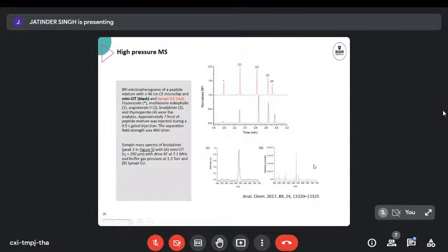And selective ion chromatography events could be collected with this field portable mass spectrometer as well. Here you can see the m/z that was selected, fragmented into the smaller components. So it works like a normal mass spec, but it doesn't have the bulk of equipment that comes with the larger mass specs, which means it can be used more easily either on the benchtop in the proteomics lab or potentially even taken into clinics.